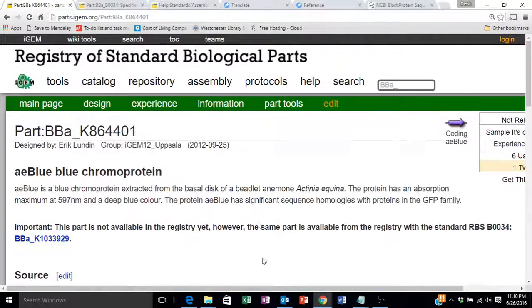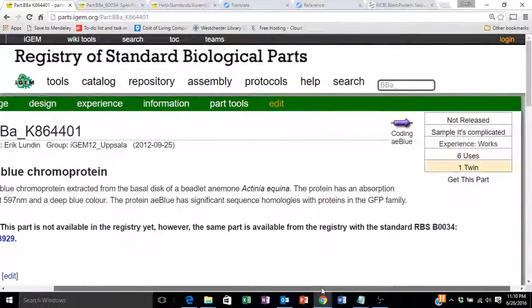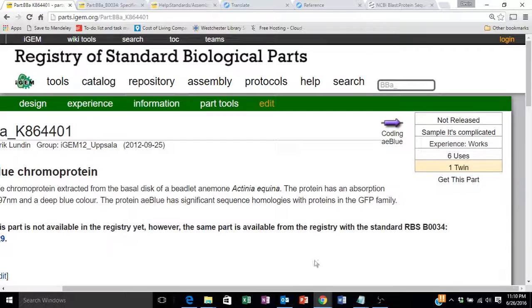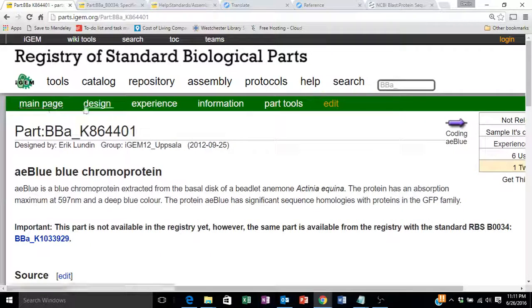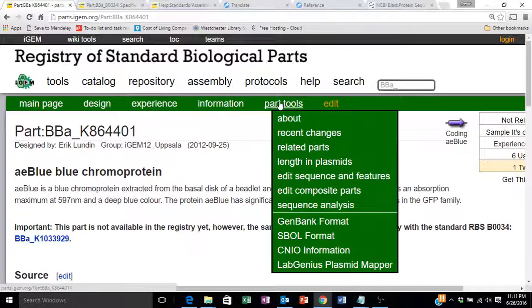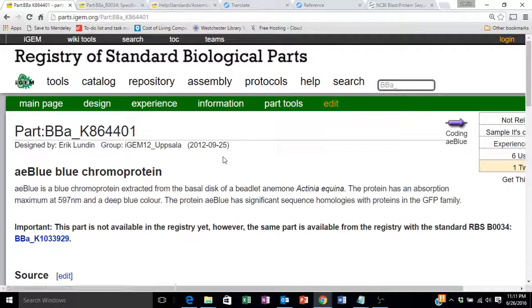Once again, we have information on its uses and other information and pages we can look at for that part.